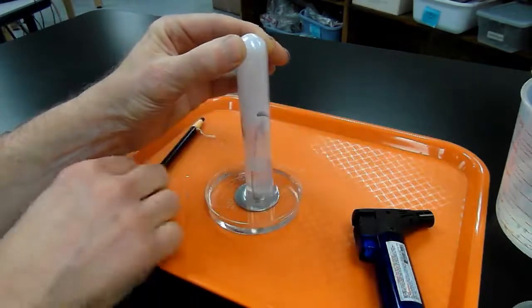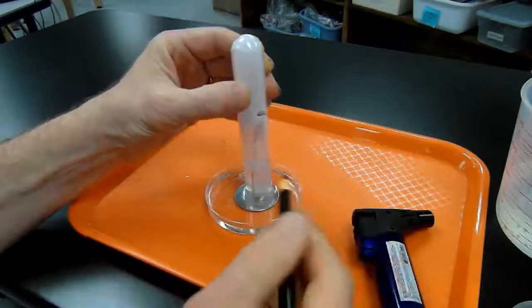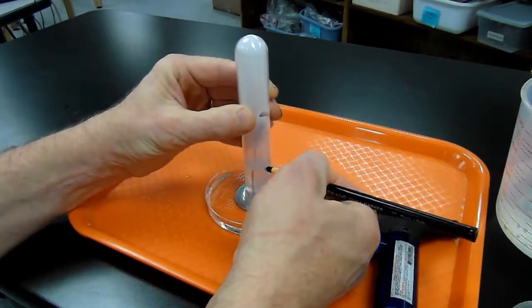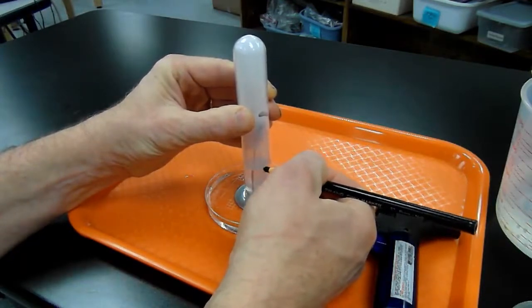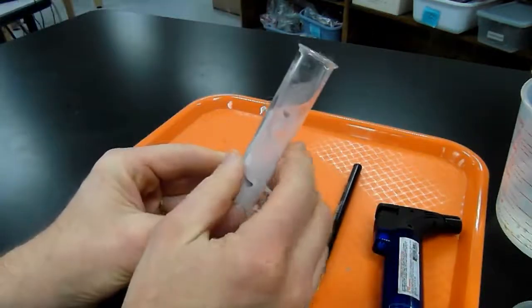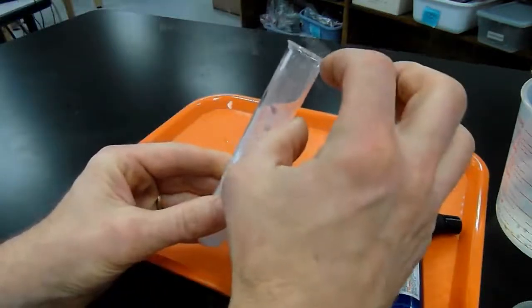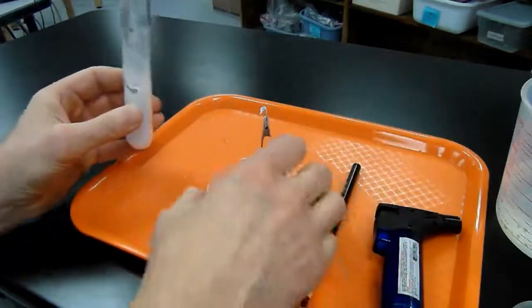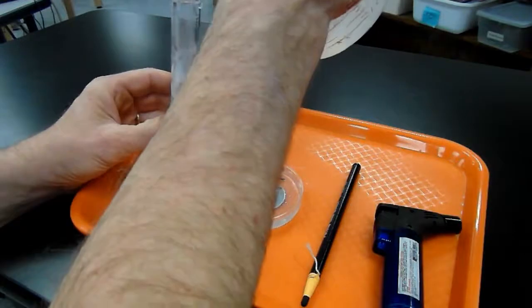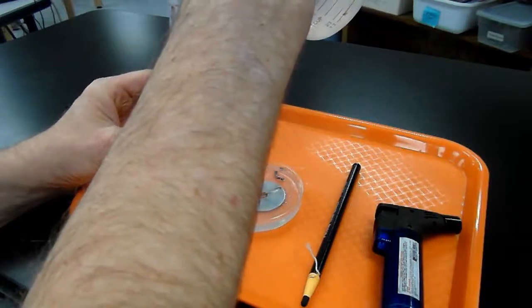It doesn't feel too warm. So I'm going to go ahead and mark that height of the water on my test tube with my China marker. And now what we want to do is figure out how much volume that represents. So we're going to have to do the following. We're going to have to measure the volume of the water up to that point.